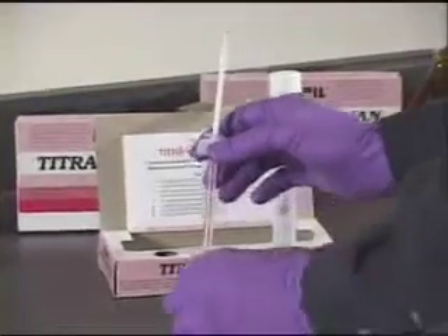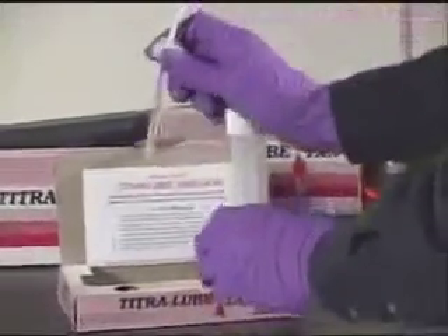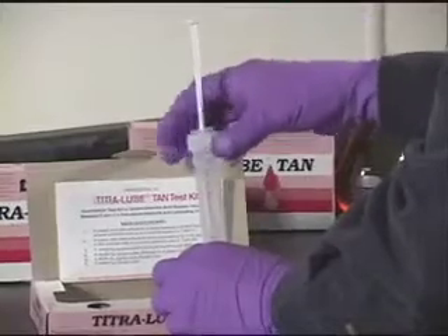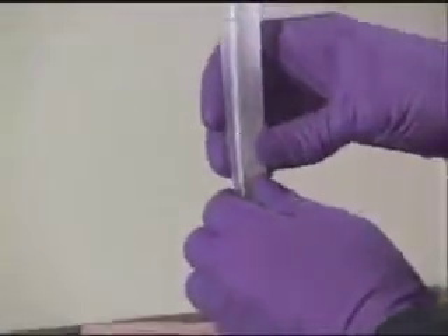Remove the twist tab at the bottom of the syringe and screw the titration syringe onto tube 2. Break the bottom ampoule. The color should change to a blue color.